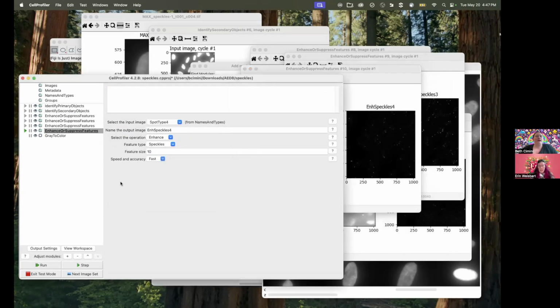Yeah. And that is also something where, again, we're guessing at the biology, because that's not really what matters for this demonstration. We're demonstrating proof of principle here. But in any situation, you want a biologist with actual domain knowledge who can tell you what they're looking for, because perhaps some of that tiny graininess, maybe there are spots that are only 1 or 2 pixels wide in those images that actually do matter to capture.